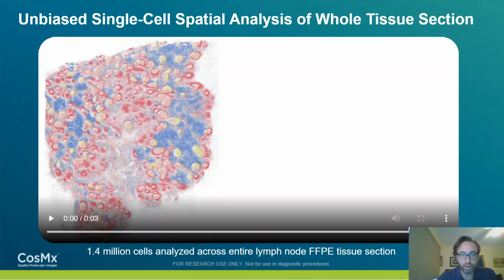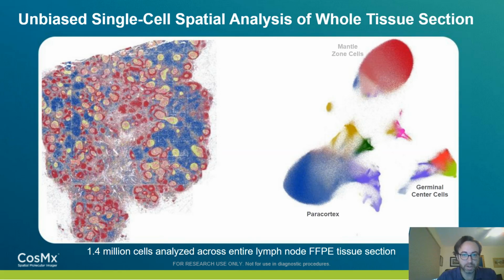So here on the right-hand side is the UMAP projection of these cells and their relatedness to each other, regardless of their physical colocalization, which is shown on the left. And again, as we have this in hand, we use this directly for doing our cell typing. This helps us identify cells that are specifically related to each other and which should be biologically similar regardless of their physical location in the tissue.